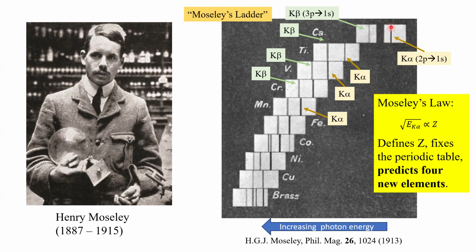The lower energy line is K alpha, which is 2p to 1s. The higher energy is K beta, 3p to 1s. And now we have titanium, K alpha, and K beta. And you can see we've got this ladder where as we move from one element to the next, the binding energies increase, the differences in binding energies increase. And so you keep moving to a progressively higher Bragg angle in that spectrometer. And then you can glue everything together and come up with these spectra.